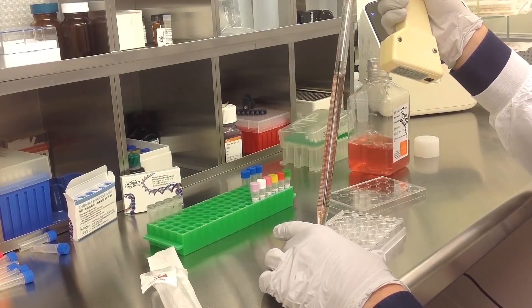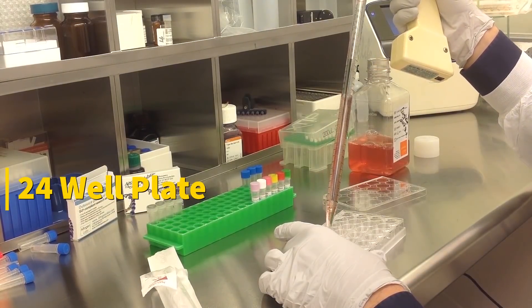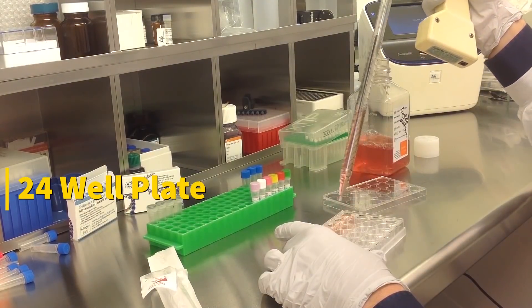In this tutorial, we use a 24-well plate. Transfections can be scaled up or down based on plate surface area as described in the corresponding transfection protocol, which can be found at altagen.com.